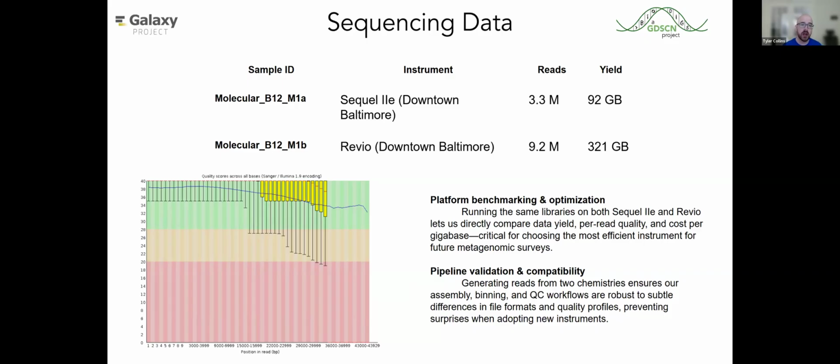And that will matter a lot for helping us get better assemblies and try and do some taxonomic identification. Slight spoiler, I guess, for now: when we tried to do the same analysis on that Illumina data we had originally pulled from, for identifying which species, about 90% of the reads weren't able to be mapped back to a species. When we use that PacBio Hi-Fi data today, about 0.02 or 0.08% didn't map back. There's a couple of caveats there, but we can discuss that as we actually get to that in our analysis later.